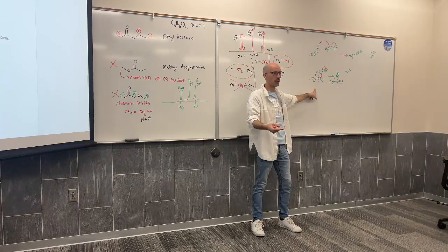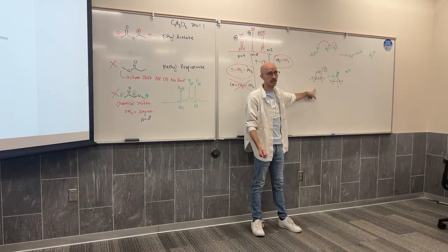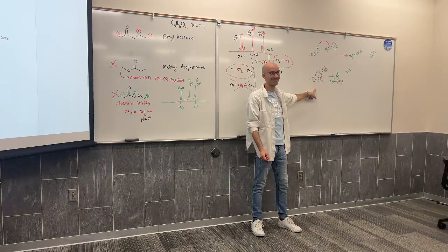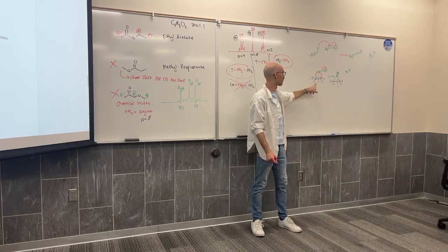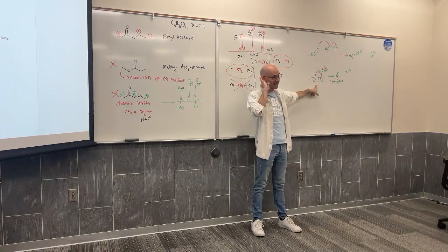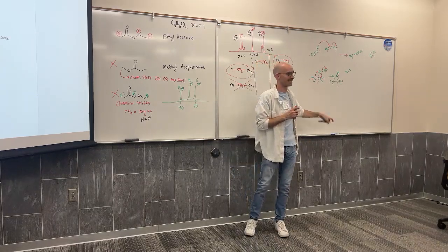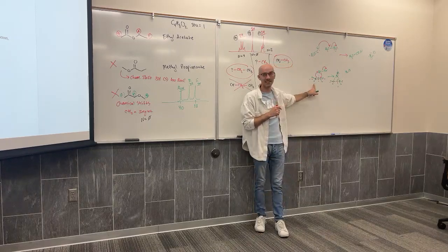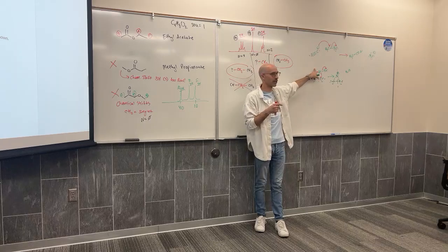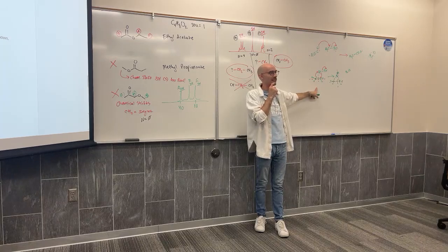And if you saw the sp2 CH, you'd also see, what's the corresponding peak for the alkene? There's literally only one other bond type in this molecule. Somebody say it. Say it wrong. What's the other bond type in this molecule that would show up in the IR? We saw the sp2 CH. No halide. Okay, well, actually the Br2 molecule probably won't absorb in the IR. CC double bond. CC double bond.